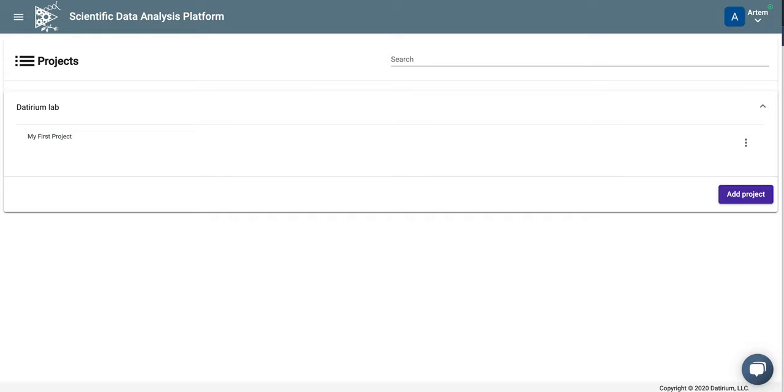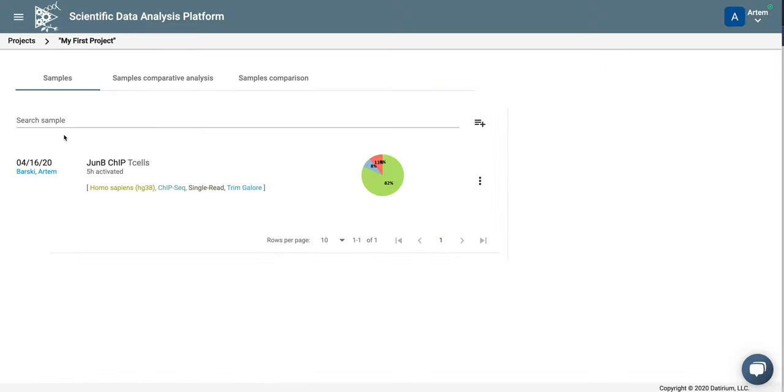Hello, this is Artin Barsky, co-founder of Datirium. In our previous video, we looked at how to start the analysis of ChIP-seq data. Let's see how to look at the results and what's important there.